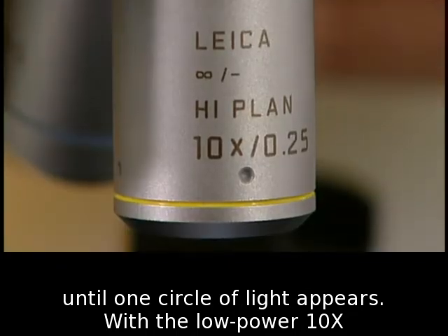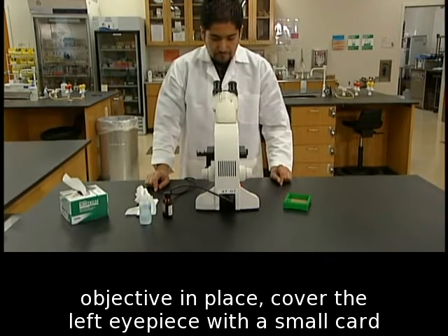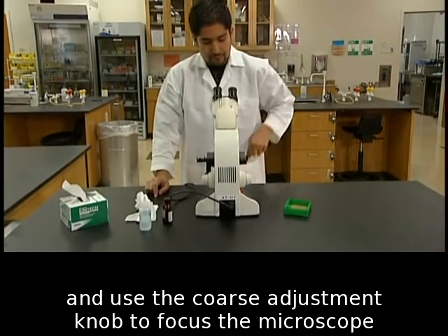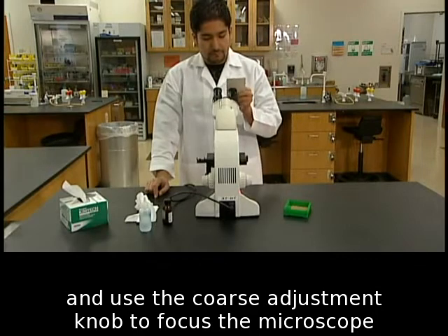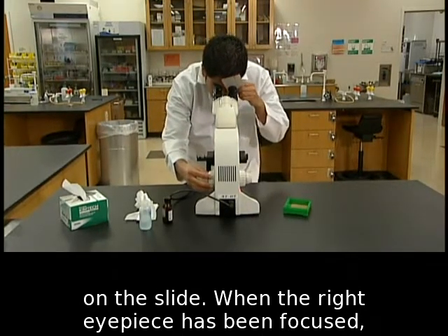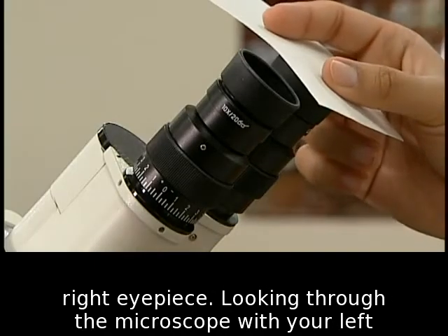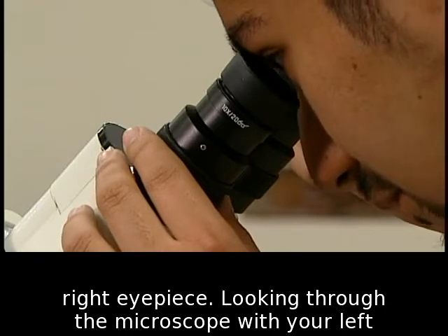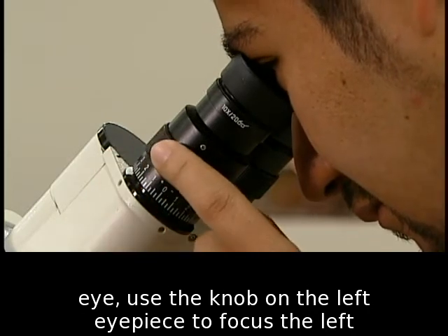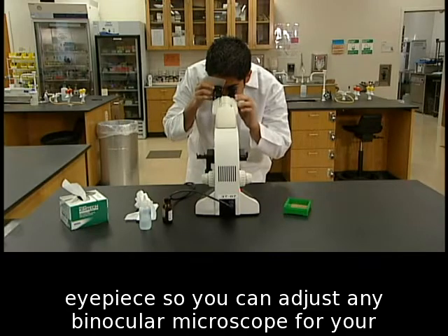With the low power 10x objective in place, cover the left eyepiece with a small card and use the coarse adjustment knob to focus the microscope on the slide. When the right eyepiece has been focused, remove your hand from the focusing knobs and cover the right eyepiece. Looking through the microscope with your left eye, use the knob on the left eyepiece to focus it, so you can adjust any binocular microscope for your eyes.